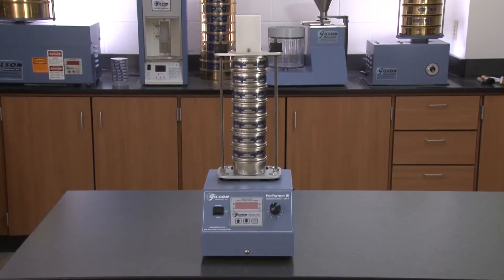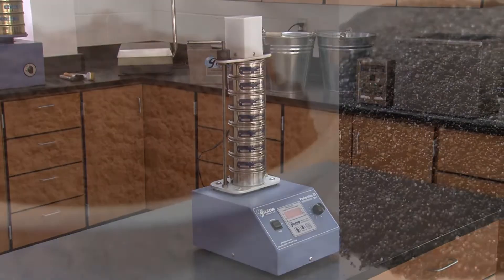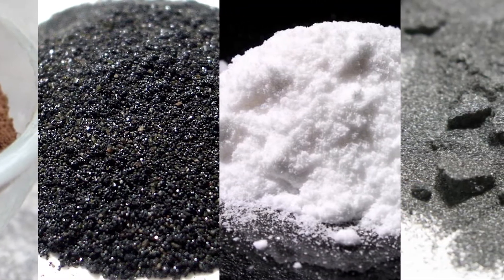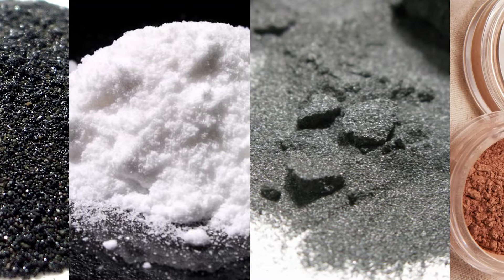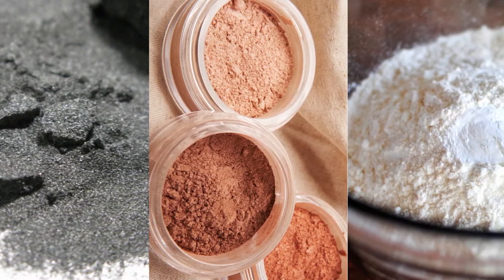The Gilson SS3 Performer 3's unique operation makes it an efficient instrument for separations of small samples of dry powders such as chemicals, minerals, pharmaceuticals, powdered metals, cosmetics, ores, and many other coarse and fine materials.